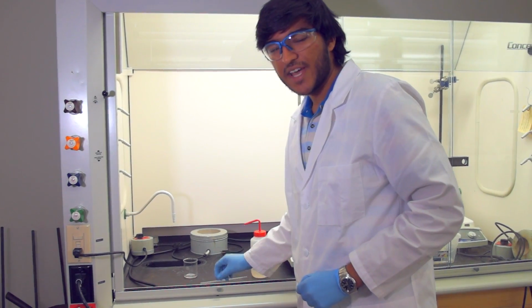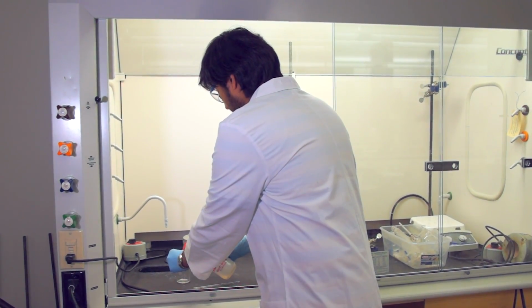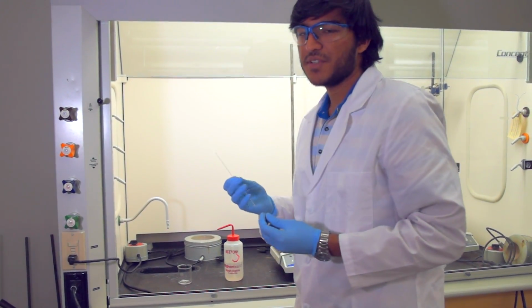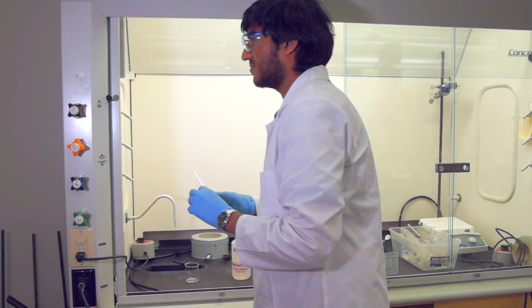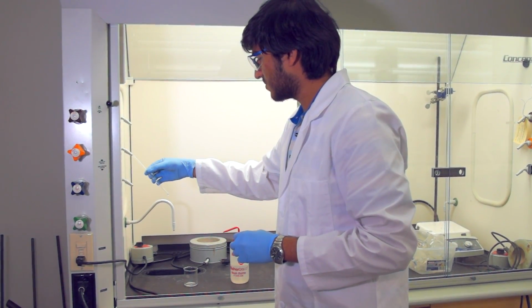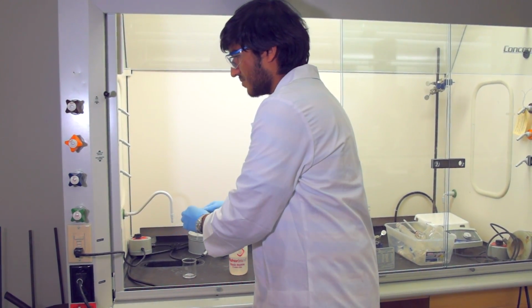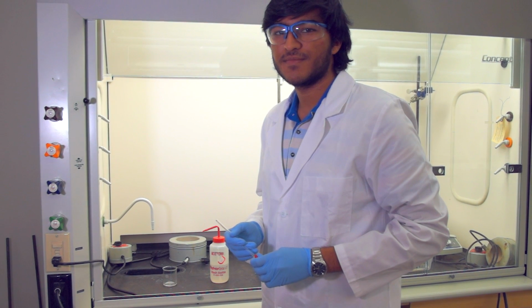I'll also rinse off the cap with a little bit of acetone too. Last, I'm just going to dry them both with a little bit of compressed air. And that's how you clean an NMR tube.